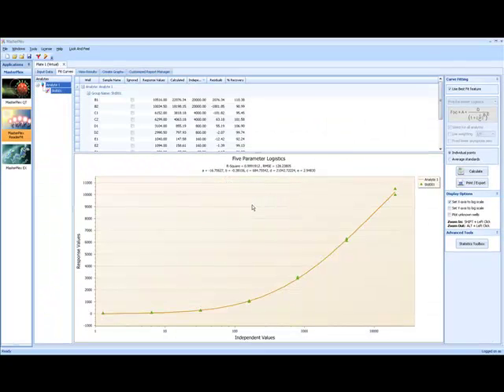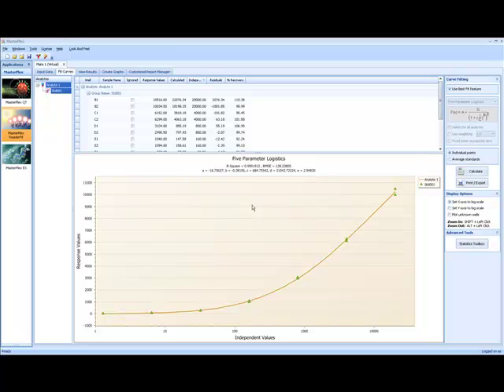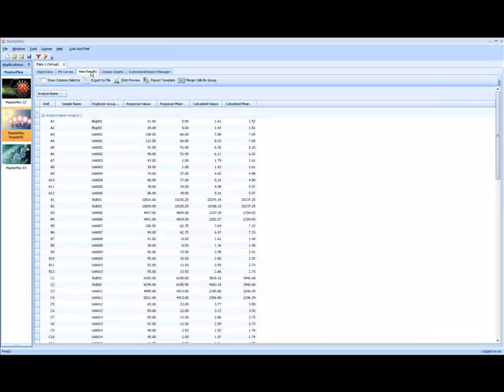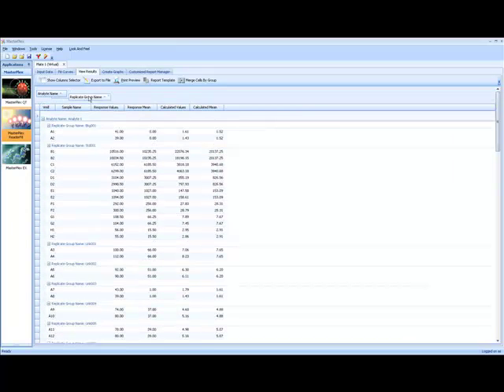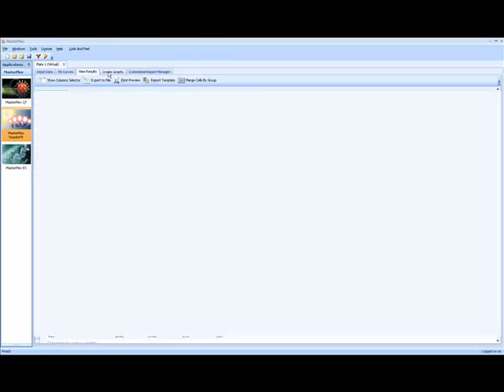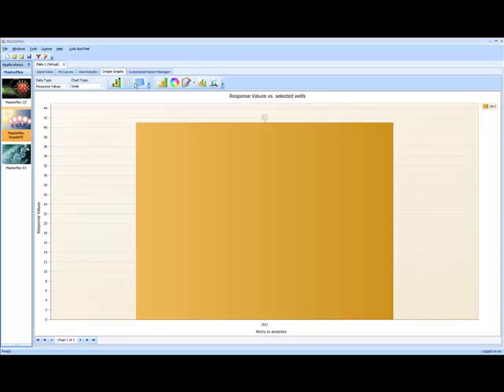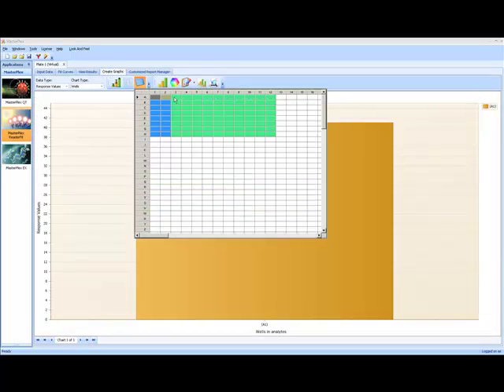I can now view my curve, review, customize, or export my results from the data table. Or I can do the same functions in the Create Graphs tab.